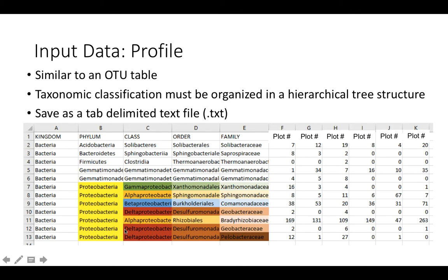Notice within the phylum Proteobacteria, there exists four classes — Alphaproteobacteria, Betaproteobacteria, Gammaproteobacteria, and Deltaproteobacteria — that do not exist within any other phylum within the sample. Notice how Alphaproteobacteria contains two possible orders, Sphingomonadales and Rhizobiales, that do not exist in any other class within the phylum Proteobacteria or any other phylum as well.